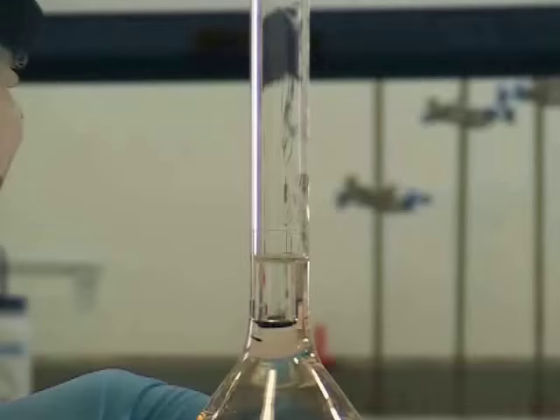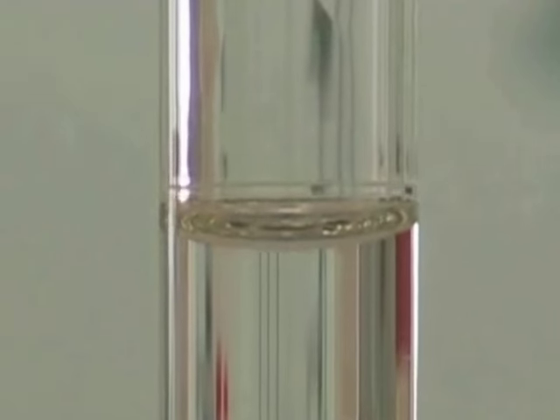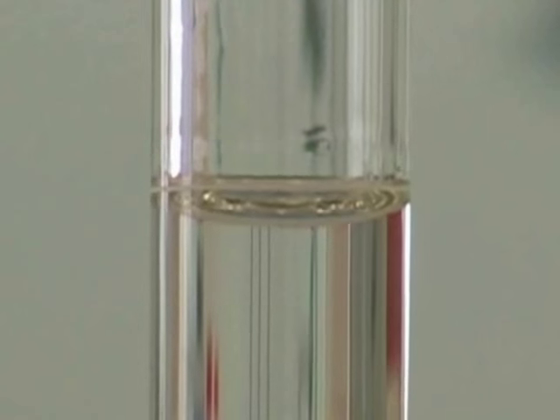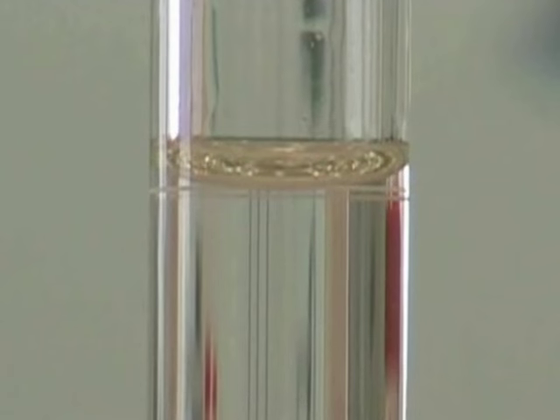When you're within a couple of centimeters of the line, make sure you're viewing at eye level and add the water very slowly in small portions until the bottom of the meniscus is touching the line. You may want to use a dropping pipette at this stage if you're a little nervous. And here you can see that the bottom of the meniscus is touching the line, so we've filled the flask to the correct level.